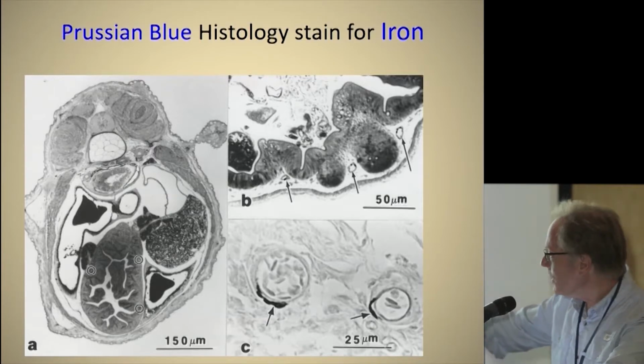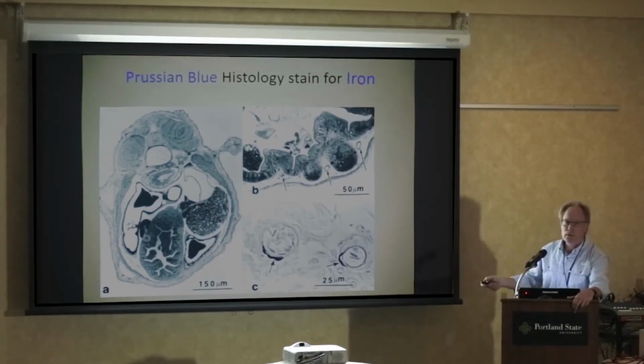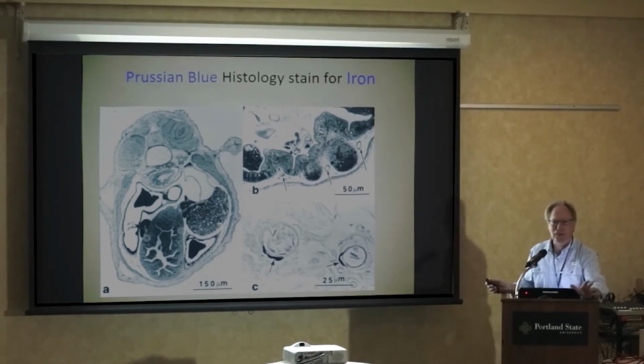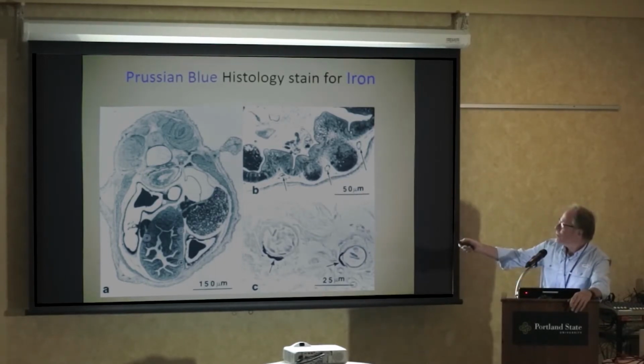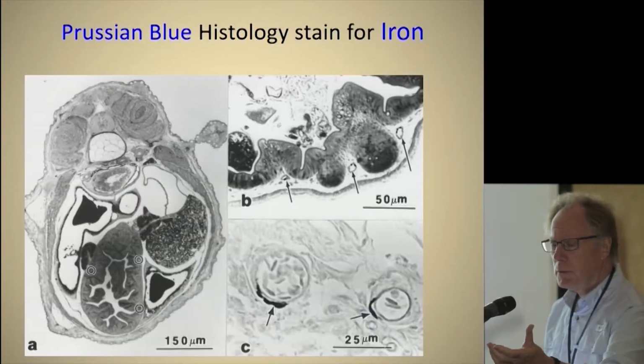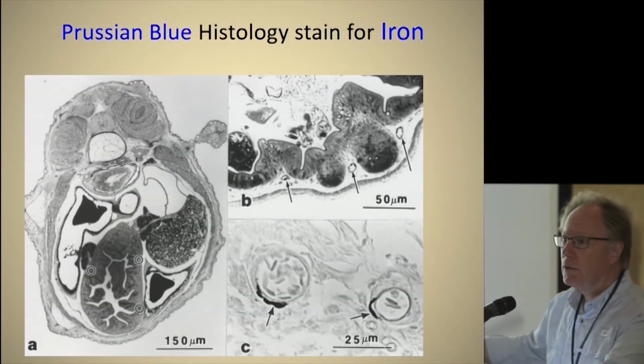This is the gut tube, and here and here and here, these are monochrome images because, Gulf and Caribbean Research publishes your image free if it's monochrome. They charge up the wazoo if it's color. But this was a Prussian blue test. So Prussian blue is an old-time histology stain that bonds to iron and only iron. And when you hit it with a light, it is, who'd have thunk it, right? Blue. And that indicates iron deposits.